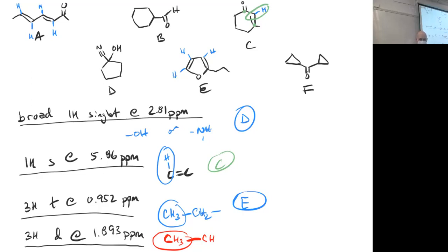So this one doesn't have any CH3s, so that's right out. This one has a CH3 right there, but its neighboring carbon doesn't have any hydrogens, right? So this could give you a CH3 singlet, but not a CH3 doublet, so that one's right out. This was a CH3 that's a triplet. We just did that one, so this one's right out. That doesn't have any CH3s, and that doesn't have any CH3s. So it has to be A, but let's look at this real quick.